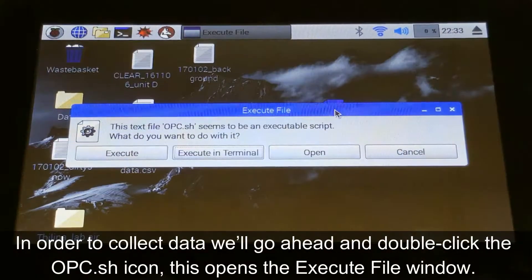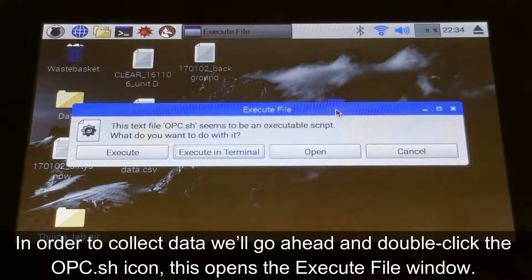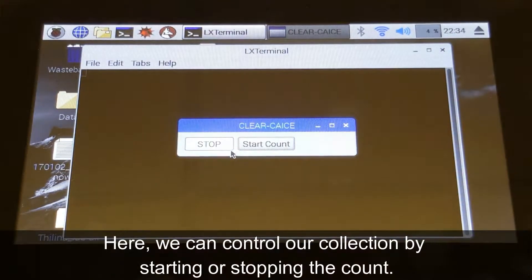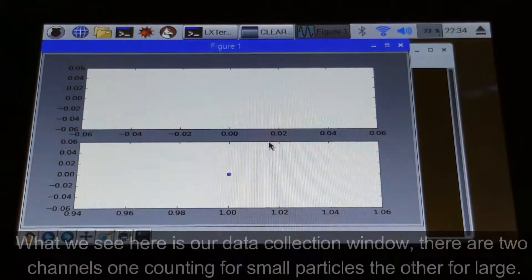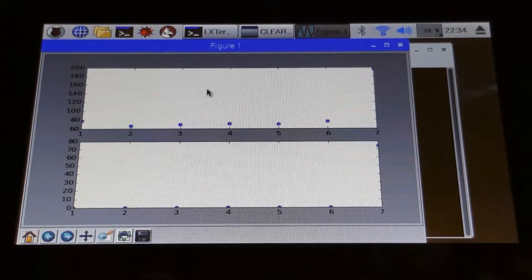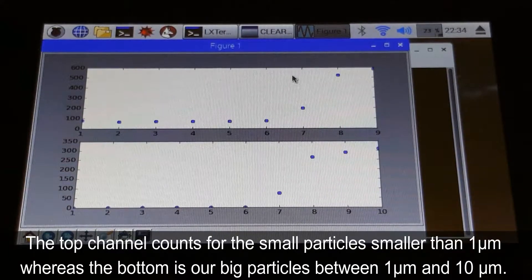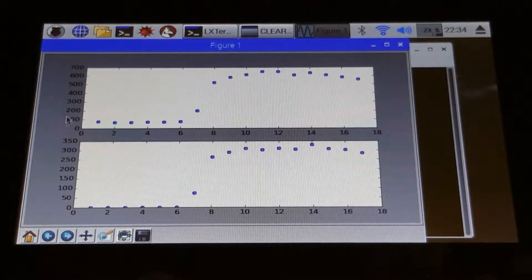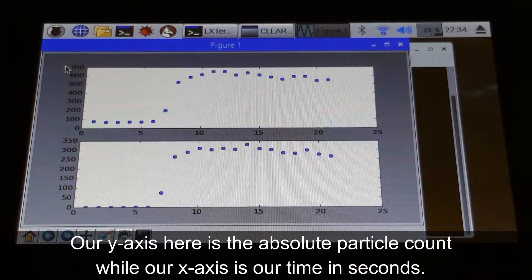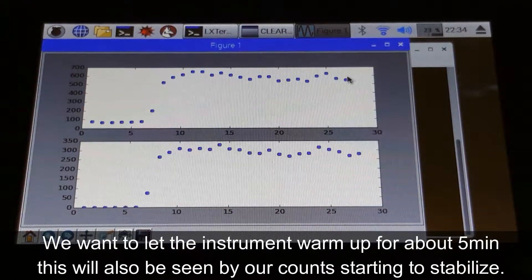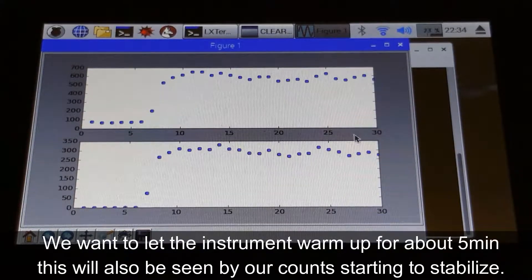In order to collect data, we'll go ahead and double click the opc.sh icon. This opens the execute file window. We'll want to execute in terminal. Here we can control our collection by starting or stopping the count. What we see here is our data collection window. There are two channels: one counting for small particles, the other for large. The top channel counts for those small particles smaller than one micron, whereas the bottom is our big particles between one and ten microns. The y-axis is absolute particle count, while our x-axis is time in seconds. We want to let the instrument warm up for about five minutes, which will also be seen by our counts starting to stabilize.